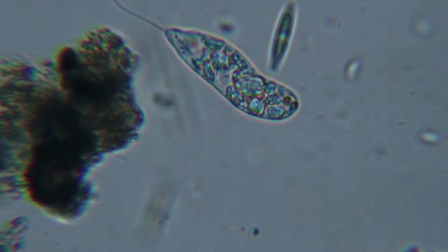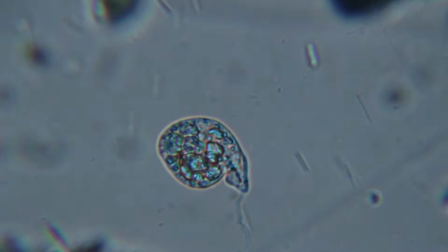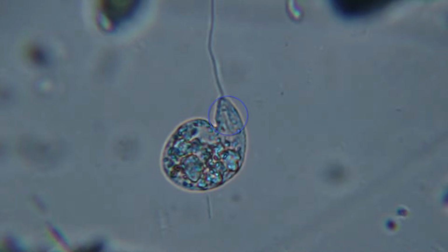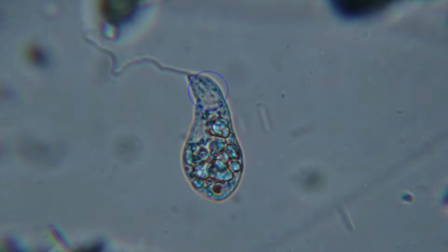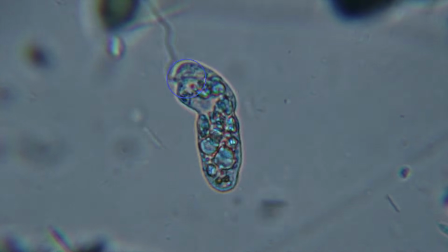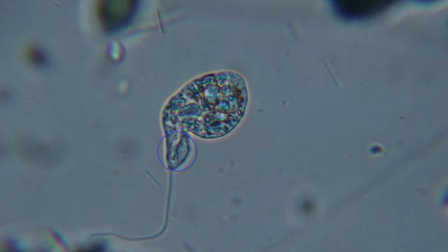If you look very, very closely, you can see a small rod-like structure in what might be called the head of Peranema. Peranema can extend and retract this small rod, and the theory has it that it can use it to batter a hole in the lining of its prey organism. It can then use its flagella to mix up the insides while it actually sucks those insides out.